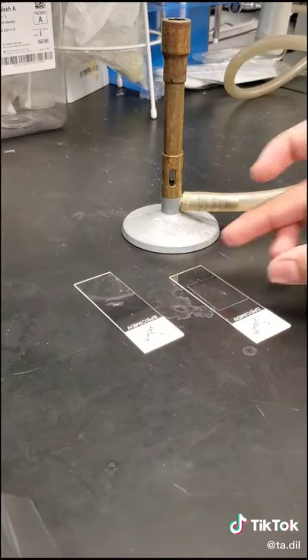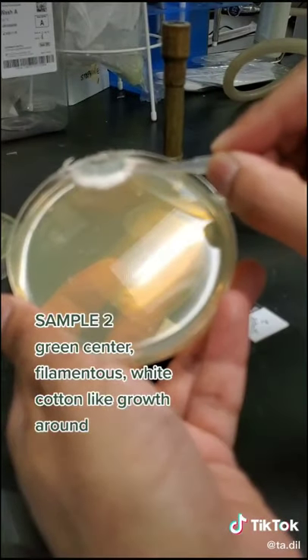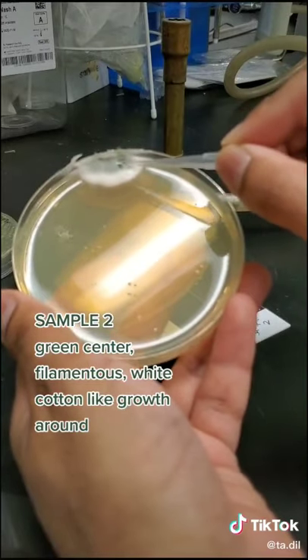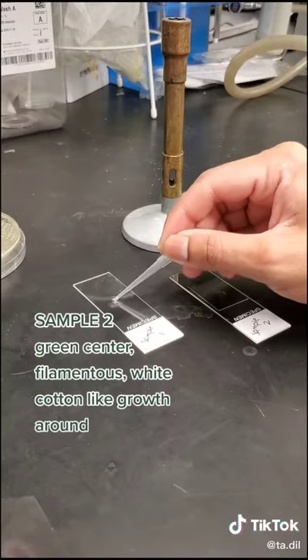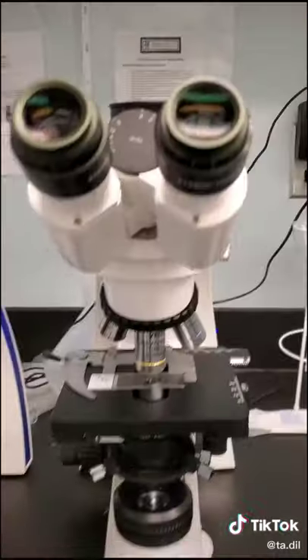I took a small sample and put it into a drop of water on a glass slide. My second sample had a green center and was covered in a white cotton-like structure. I prepared this one the same way, put a cover slip on top, and then looked at it under a microscope.